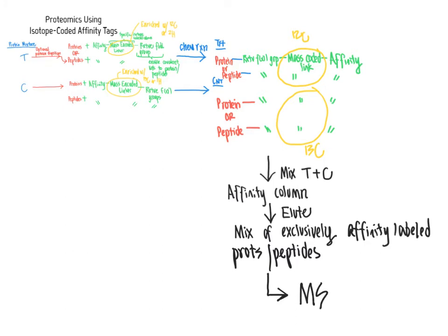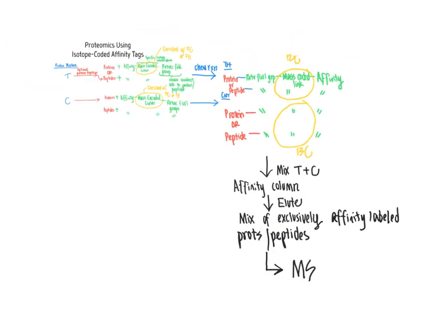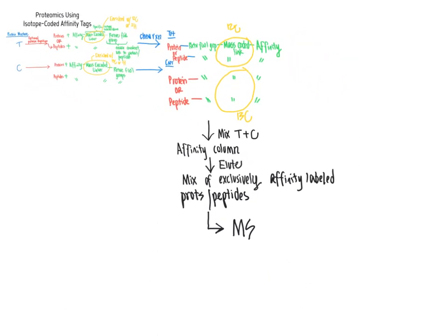And with mass spectrometry then, the resulting mass spectrum, if we look at the mass to charge ratio, so I'm going to make a mass to charge ratio plot here, m/z, and then relative abundance here on the y-axis. We normalize that relative abundance to 100.